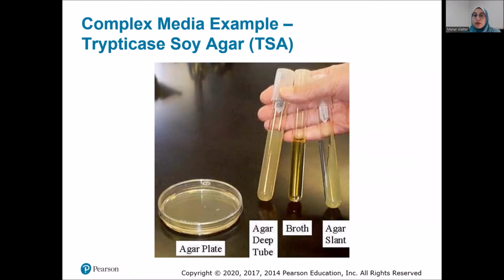So all of these are Trypticase soy agar, but one is a plate so that you can actually plate out and see colony morphology. This is a slant right here. Slants are used for long-term storage of microorganisms because plates will dry out, but slants have lids, and so they won't dry out as easily. And you literally just pour the hot liquid agar in there, and then you just slant them, and when they dry, they solidify as a slant.